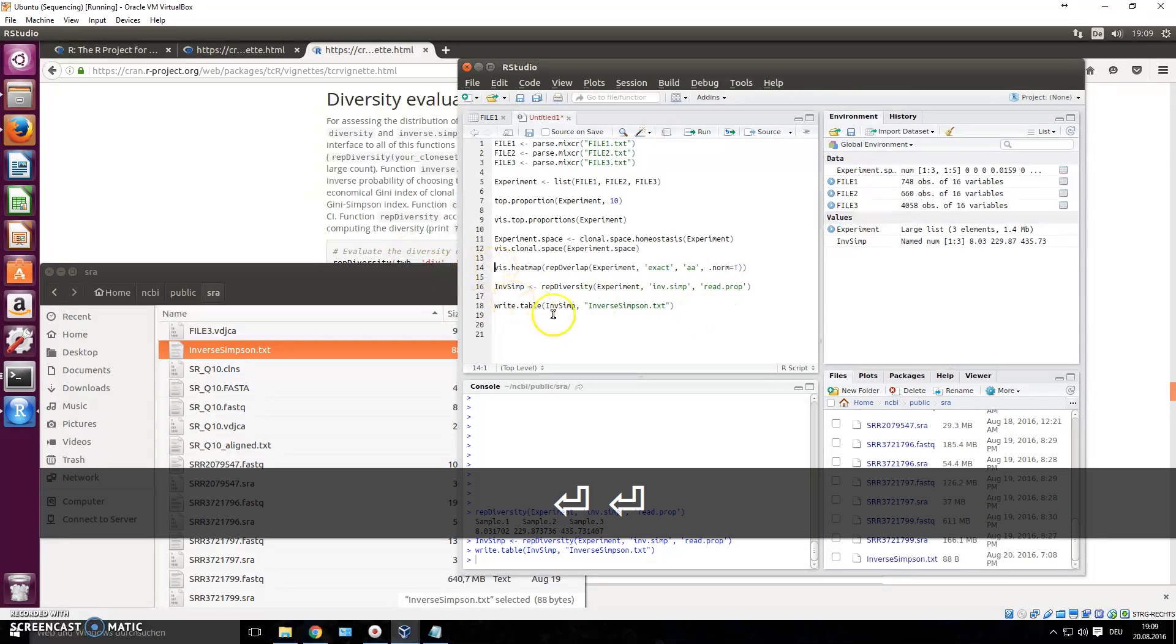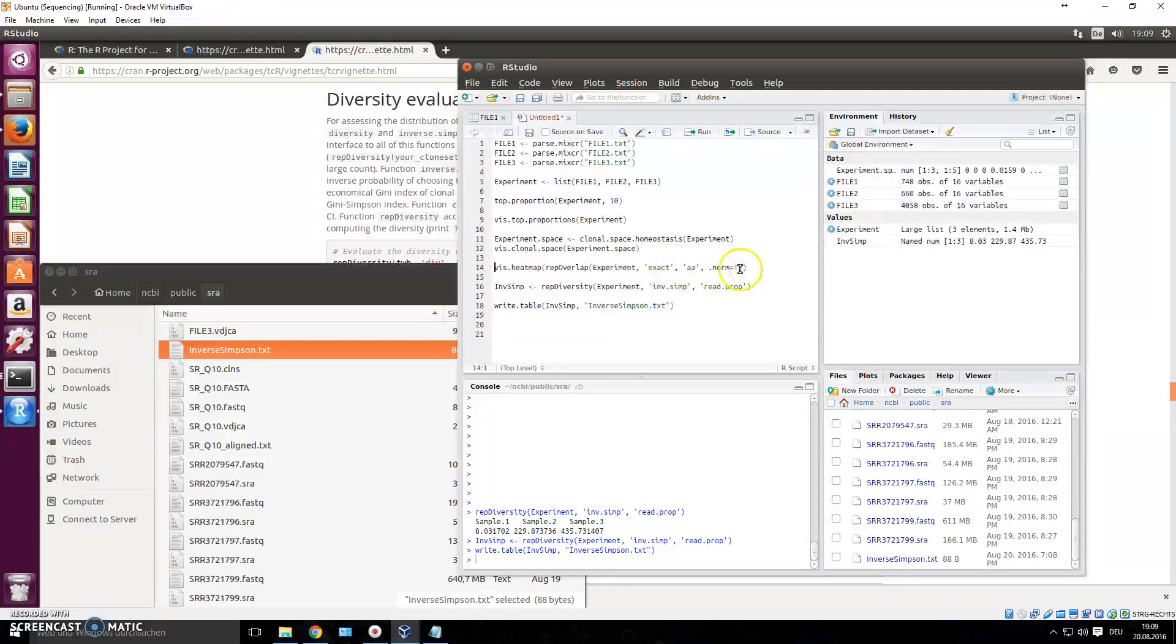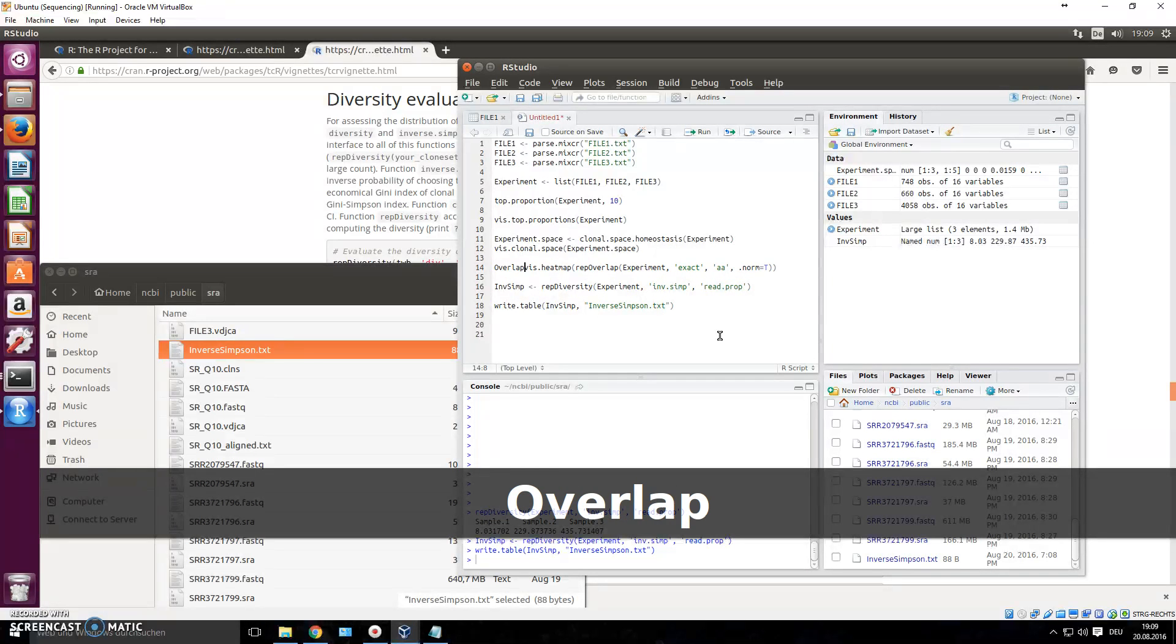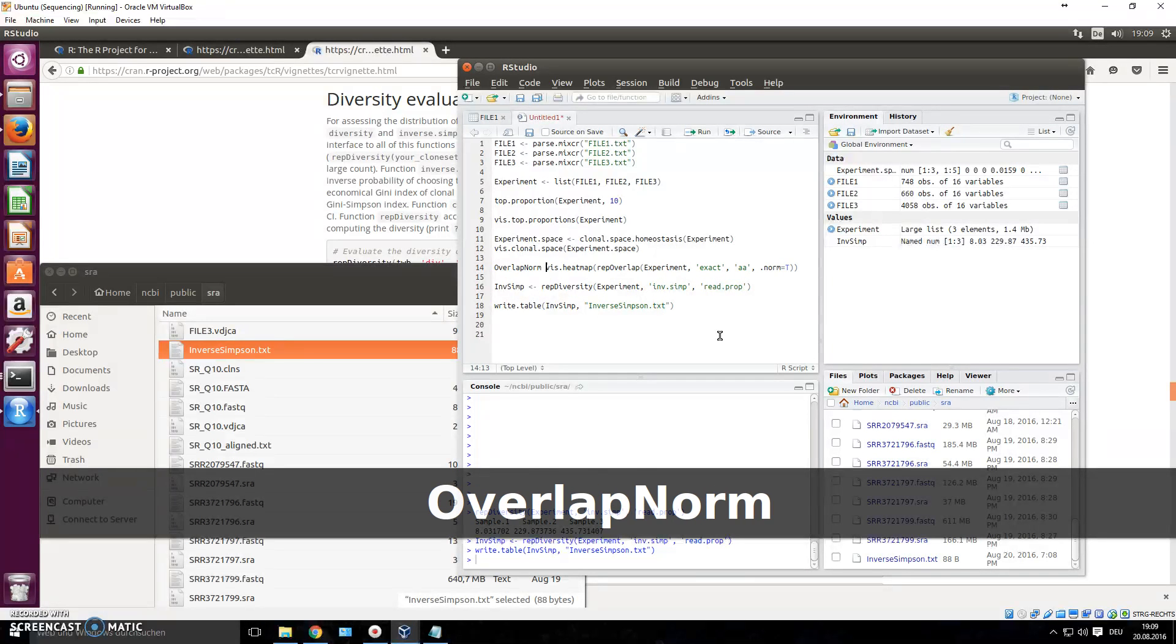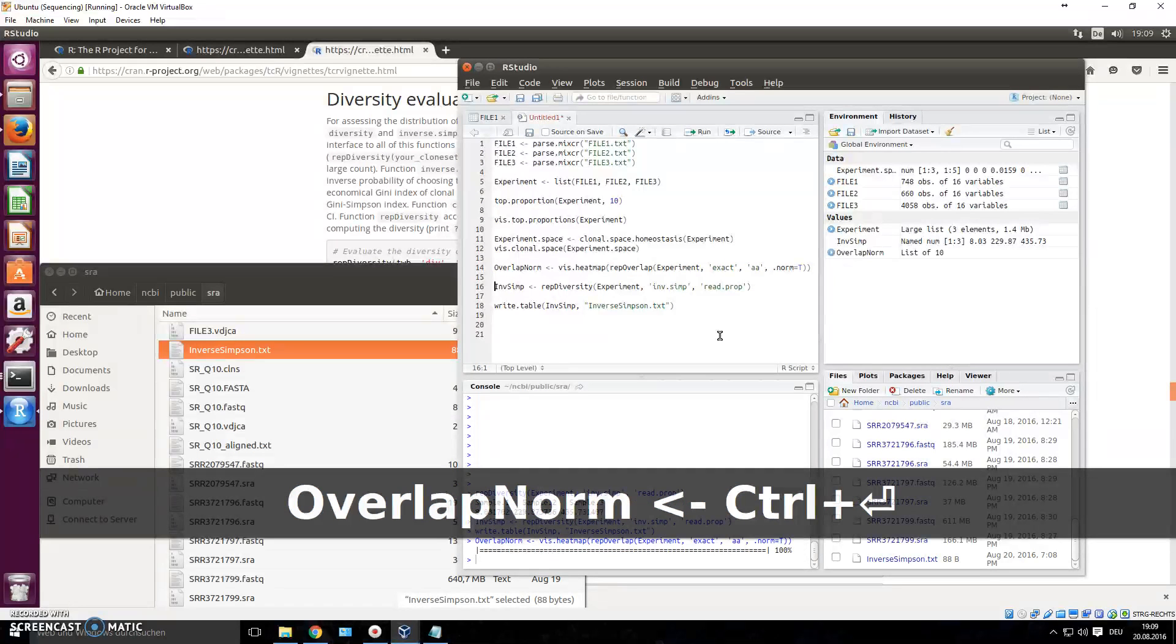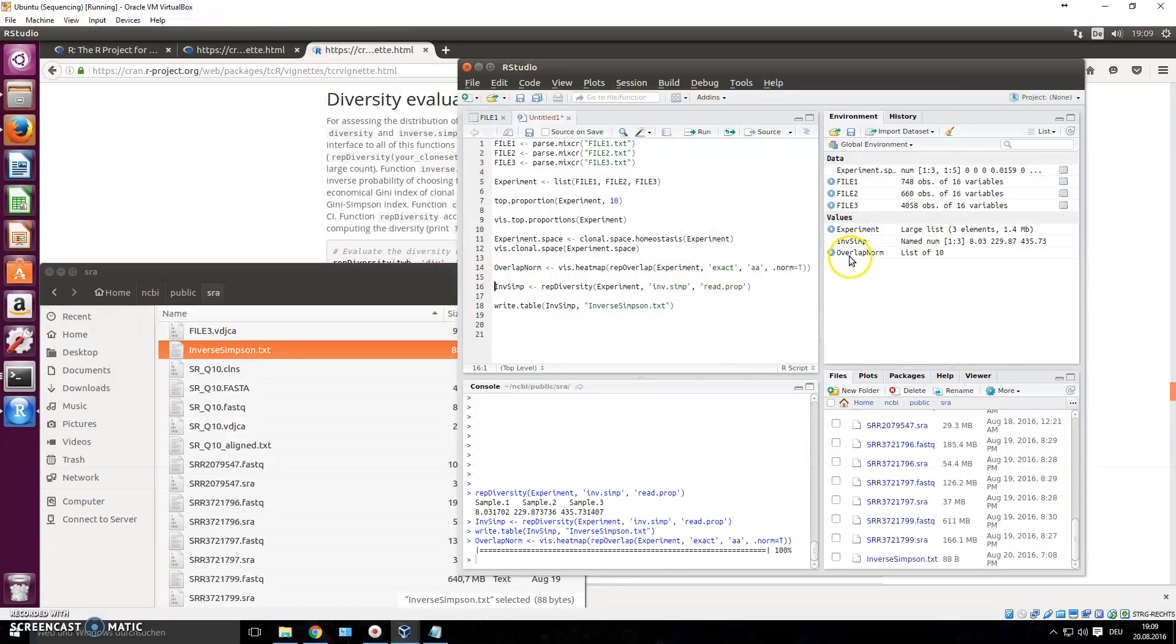So let's say we put our heat map here into a name, and we call this overlap_normalized, okay. You do the arrow CTRL enter. So now this is also saved.